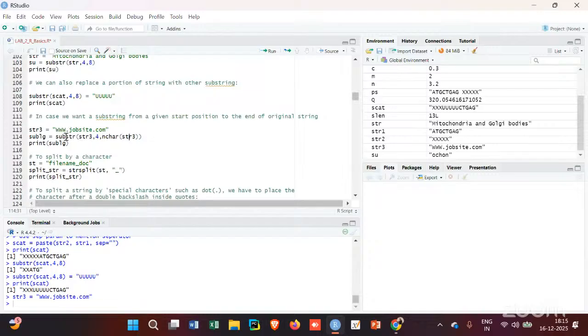This opens up a whole new bunch of possibilities. If I run simply this and press enter, you see that this function ultimately returns the number 15.